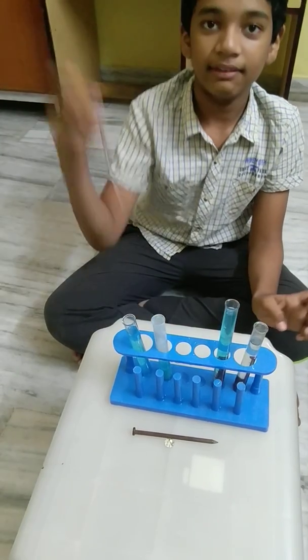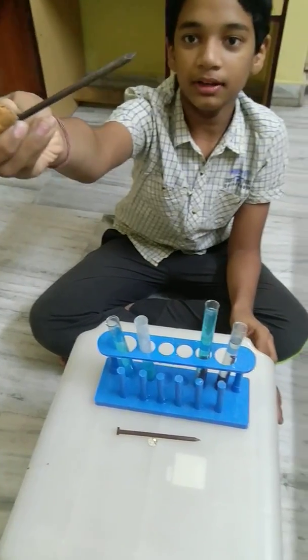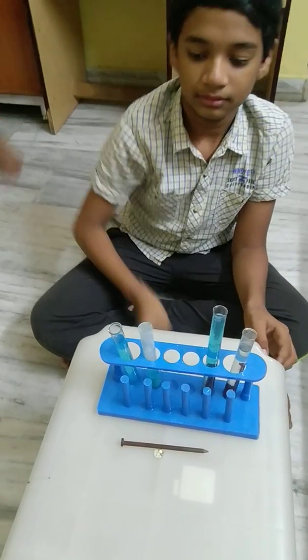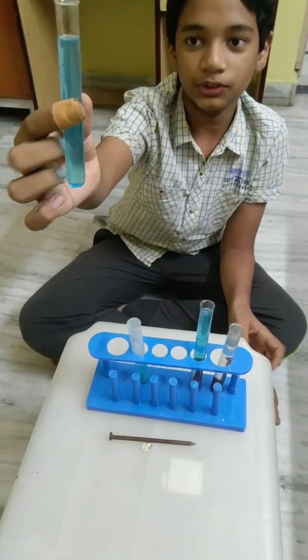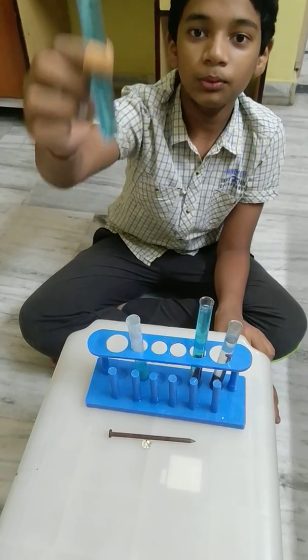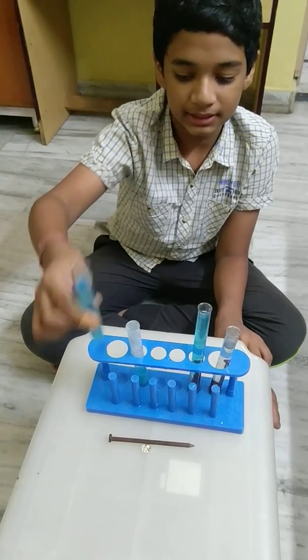First of all, we need an iron nail — it is completely normal. Next, we need copper sulphate solution. I have dissolved 2–5 grams of copper sulphate in water and have completely mixed it.